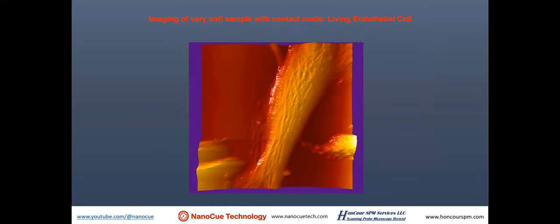A lot of times when you study biological molecules or biological samples, in this case living cells, you have to image something in liquid. This is a live endothelial cell. This cell is very soft. When you scan something that's very soft, a living cell, it has to be in physiological conditions. You have to keep the cell alive, not dehydrated. And then you can use contact mode to image a living organic biological species. Liquid imaging is very essential.